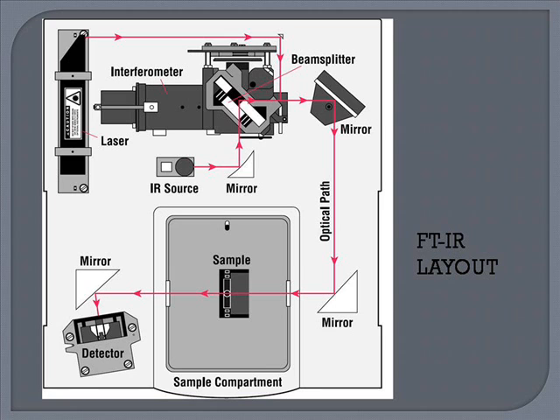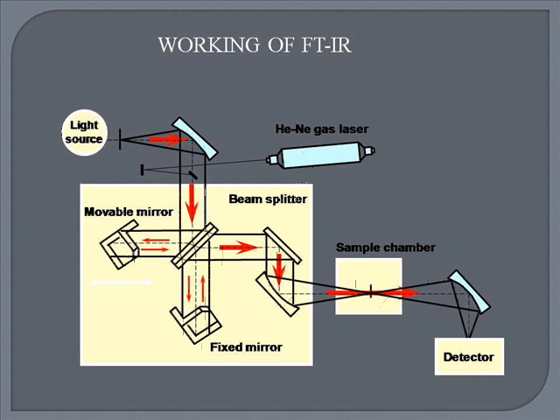The modulated IR beam passes through the gas sample, where it is absorbed to various extents at different wavelengths by the various sample molecules present. Finally, the intensity of the IR beam is detected by a detector. Components of FTIR are source, Michelson interferometer, sample, and detector.